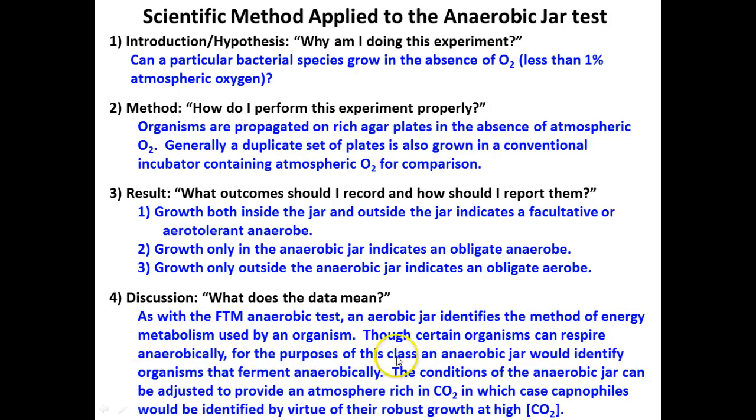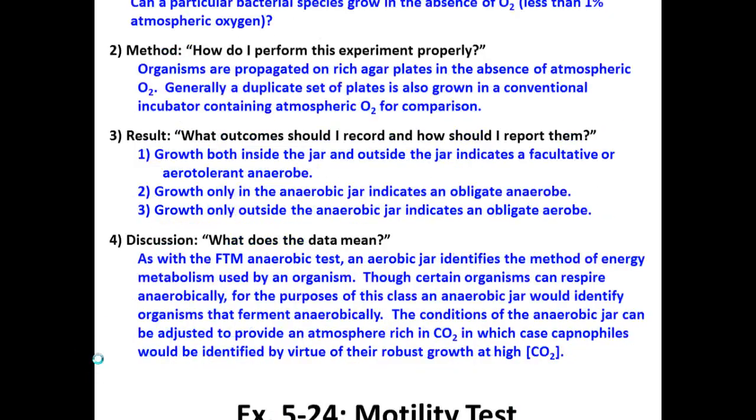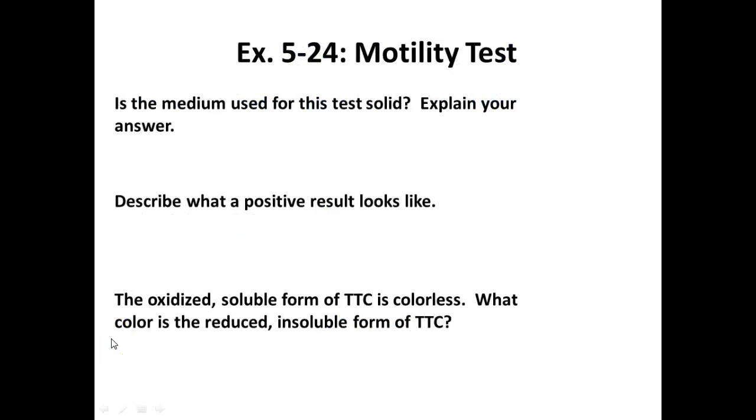So FTM tubes are going to give us that information for our organisms. We're obviously not setting up these jars, as I said, because we don't have enough for everybody to use. Our last one that we're going to talk about, and that you inoculated last week, is our motility test. This is just one of the tests that we'll do. You'll read about another one for homework that we'll do on our organisms next week as a confirmation.